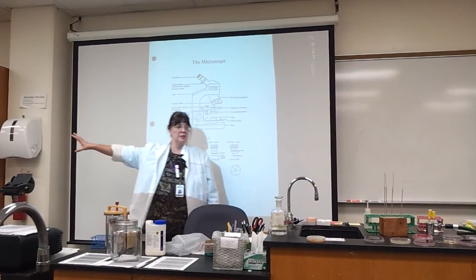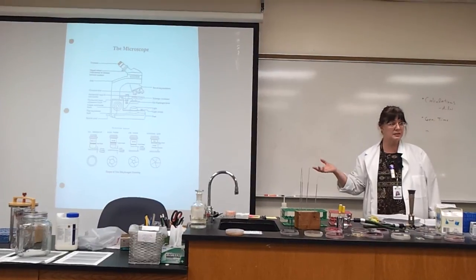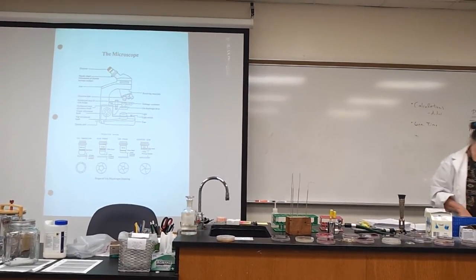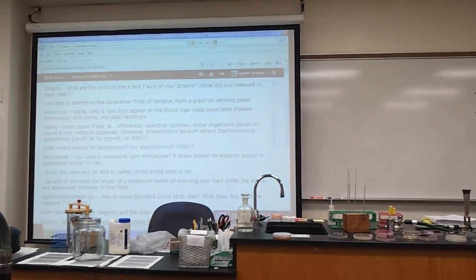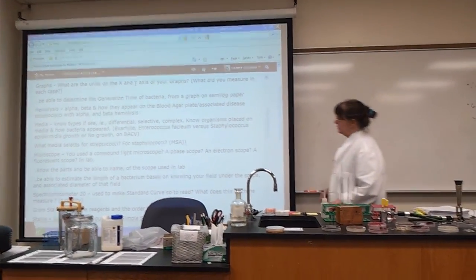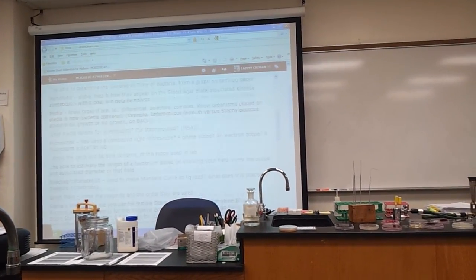Please don't tell me that's an electron microscope. There are parts over here, so try to find where the labels are. The labels, by the nature of what I'm trying to label, can't be big. So pay attention to that. Coming back, let's compare. This is not an electron scope. We already said no.